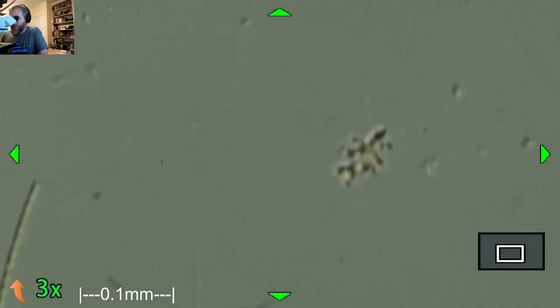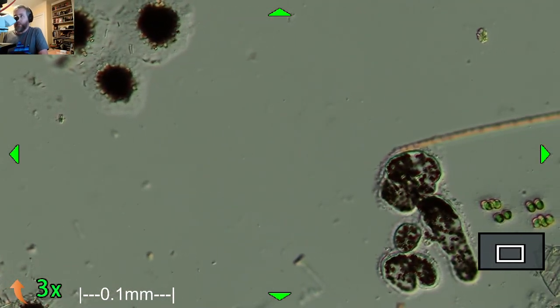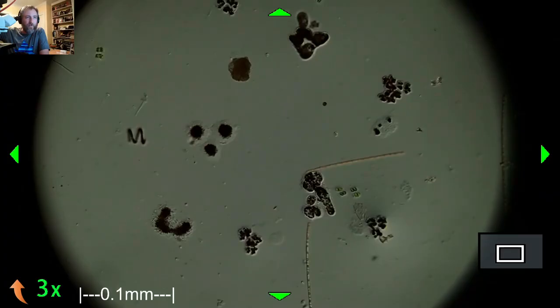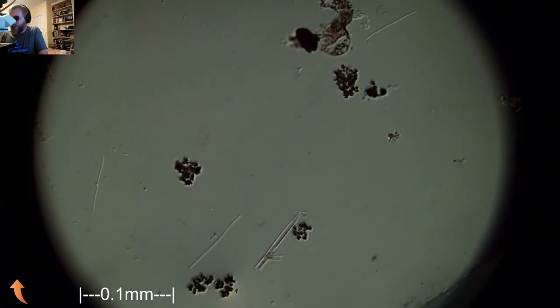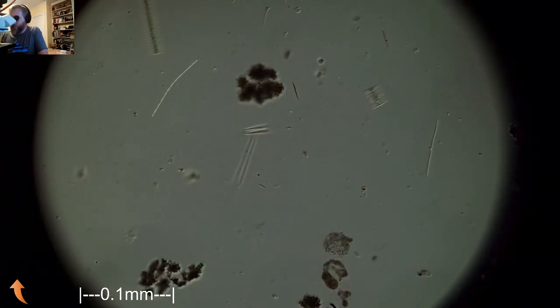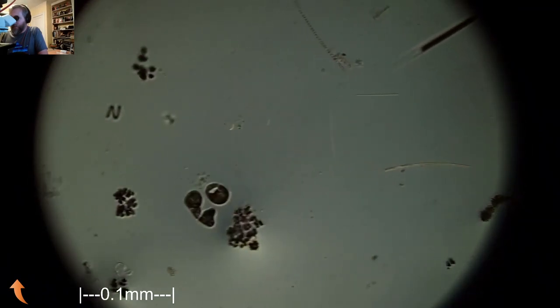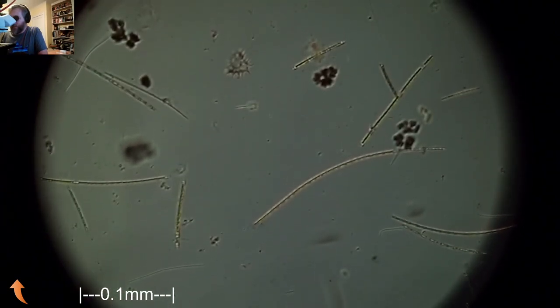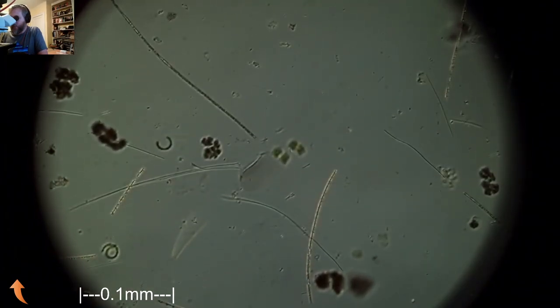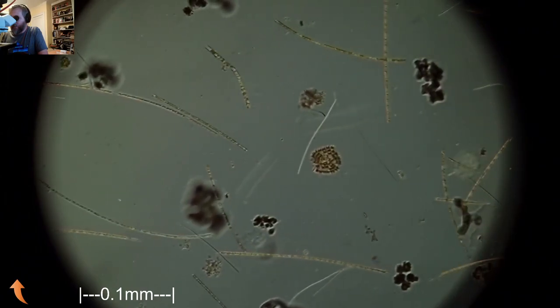And I'll just do away with it. Some of this green algae is like past its expiration date. So there's some more Pediastrum. There's some Anabena. And the funny thing is that the lake is called Clear Lake, and it is anything but clear. The water is kind of like a yellowy-brown color. It's filled with diatoms and algae and zooplankton of all kinds.